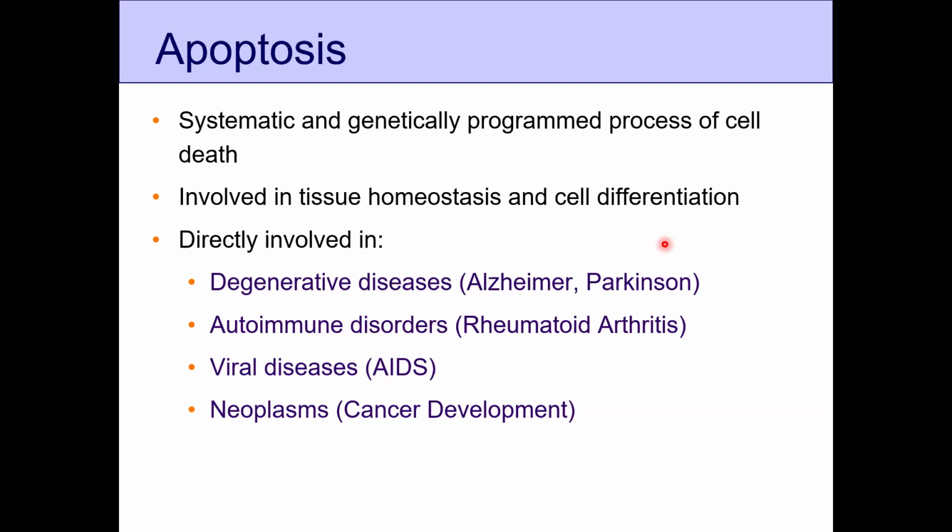Even in the normal life cycle, right now inside me, inside everyone, there is apoptosis happening, because the cell gets aged, and after a certain time it will undergo apoptosis and then die. There is a kind of automatic death. So this is a vast topic, and flow cytometer is one of the best techniques for apoptosis.